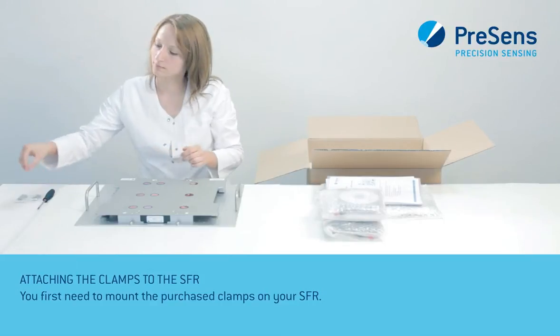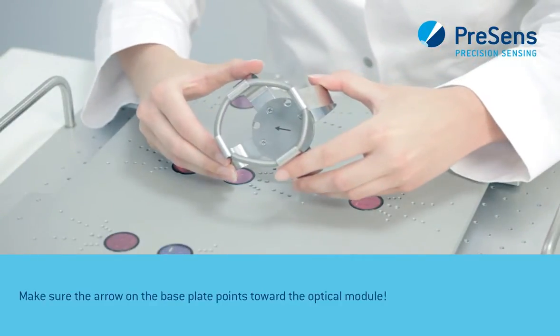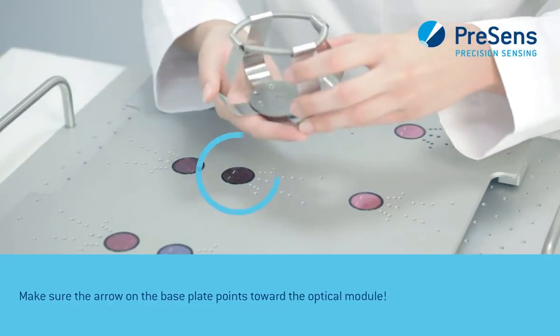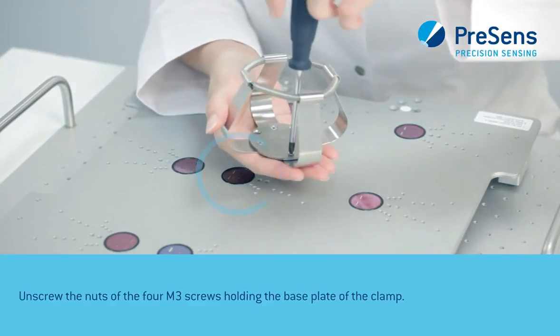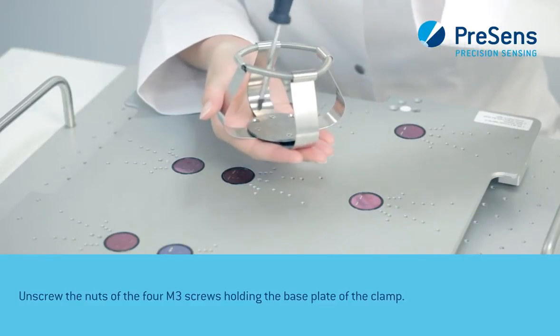You first need to mount the purchased clamps on your SFR. Make sure the arrow on the base plate points towards the optical module. Unscrew the nuts of the four M3 screws holding the base plate of the clamp.